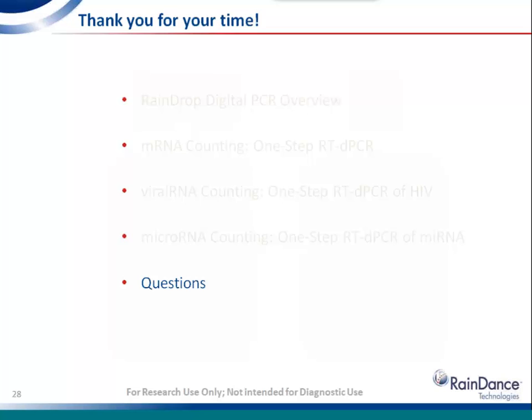Next question, please. To determine the number of miRNAs in body fluids, how would you normalize? You know, that's a really interesting biological question, and it actually is a very challenging one. The reason why I showed a couple of different controls for the miRNA experiments, both endogenous controls and exogenous spiking controls, was really to address that exact question.